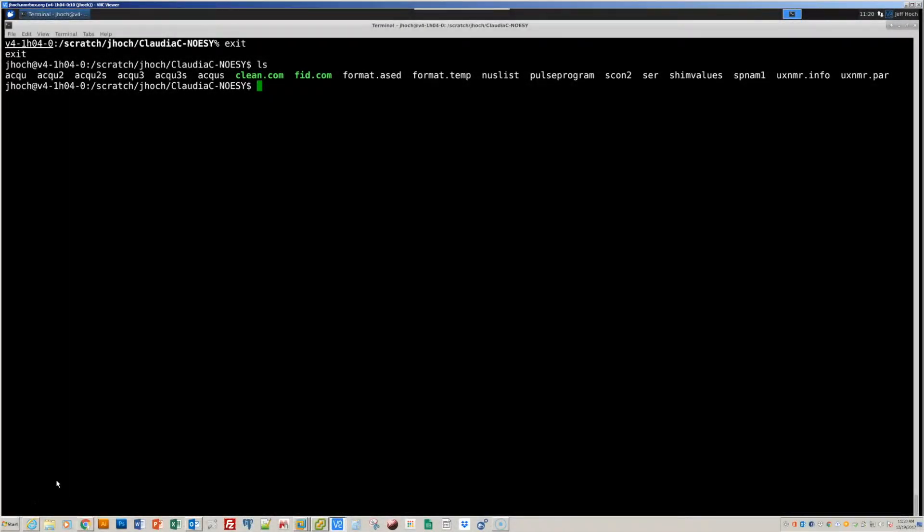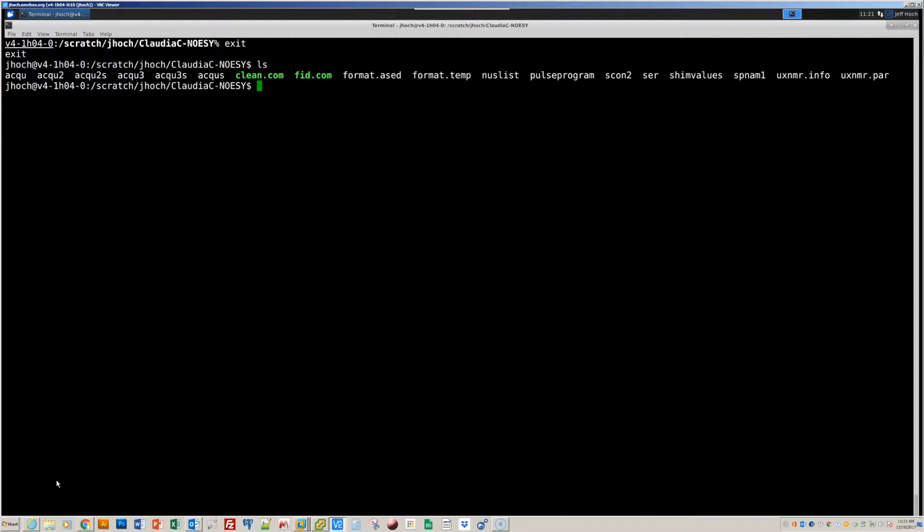Hi, this is Frank Delaglio. It's December 19, 2017 at UConn. Today we're going to look through the details of converting non-uniformly sampled data and processing it with the latest tools in NMR pipe. When we use these tools in the NMR box environment, the first thing we do is start a C shell, because all the NMR pipe tools need the C shell environment in order to work properly. So from the command line, I'll type C-S-H. And that will start our C shell.